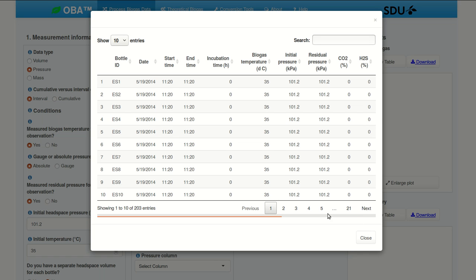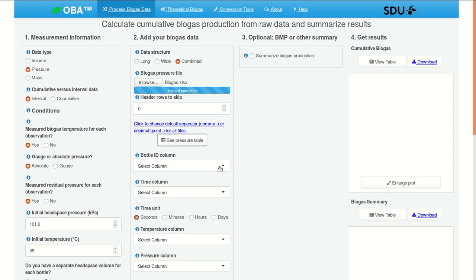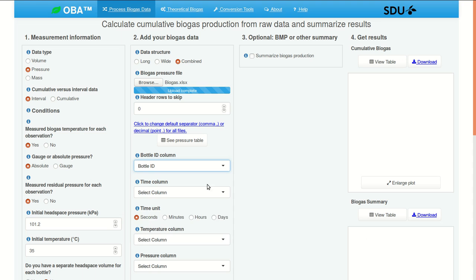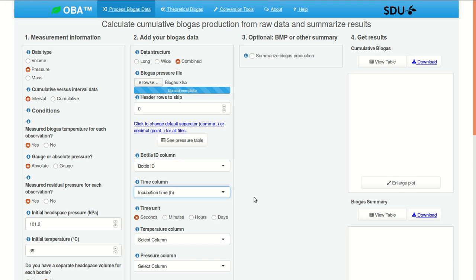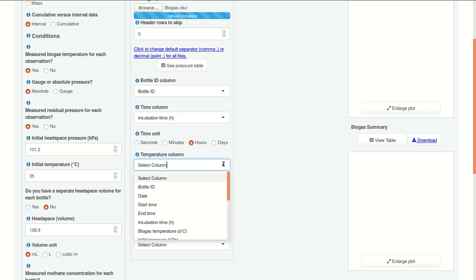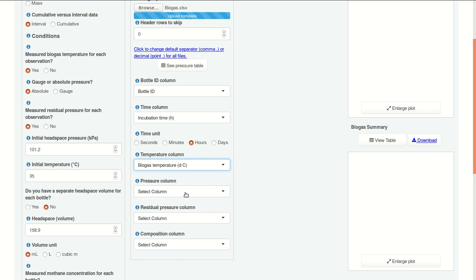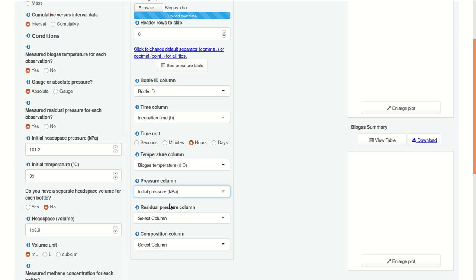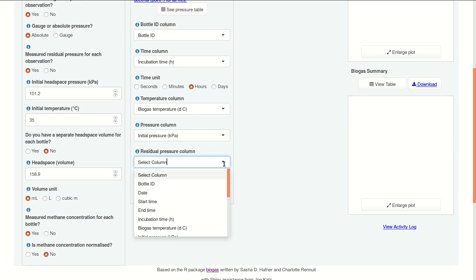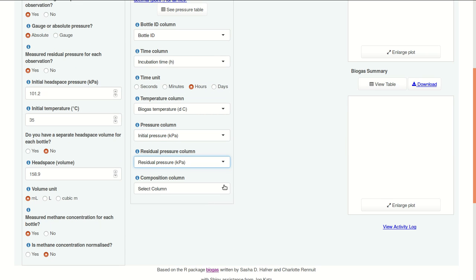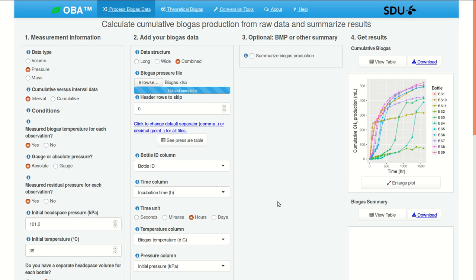And it looks like it was reading correctly. So we have 21 pages of data here. The bottle ID column is called bottle ID. The time column is incubation time, and our time units are hours. Temperature, biogas temperature, pressure, initial pressure, that is before venting, and then residual pressure. Composition, we'll use this corrected but not normalized value.